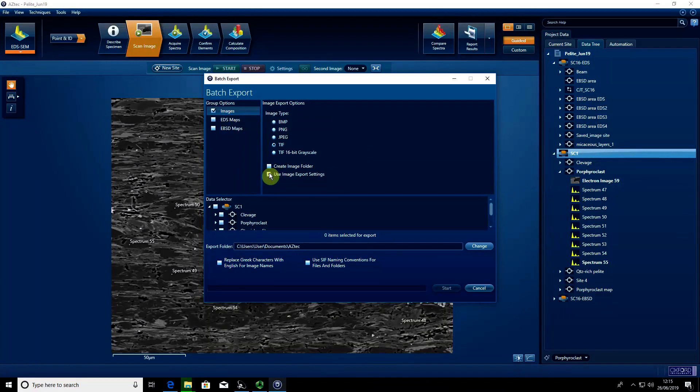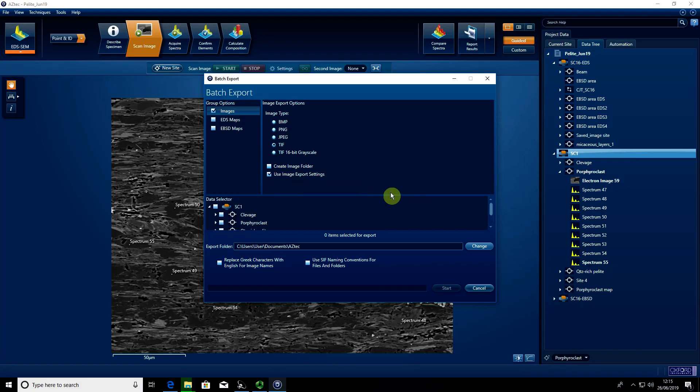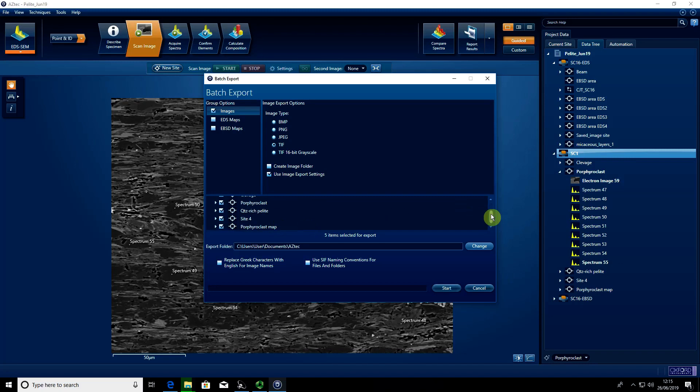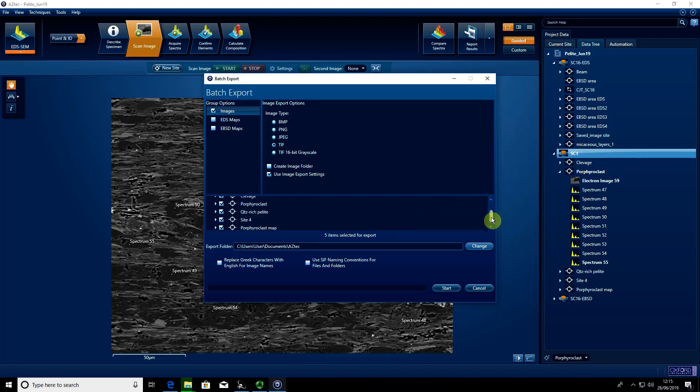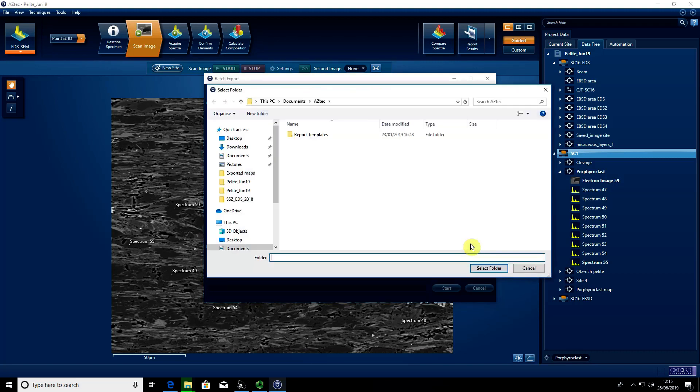I want to use the image export settings because I know I've input the best pixel resolution I can possibly get. It's not going to compress my data. Then I can select all of the sites within this sample and save them to my folder.